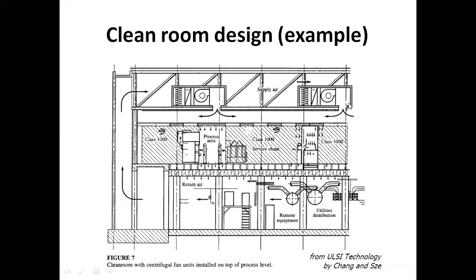So here you could see the air conditioning unit which is blowing the air conditioned air, and that air is passed to the HEPA filter. And in the HEPA filter, the dust and dirt is removed, and we have clean air. And these are the air conditioning systems where the air is cold and then it is circulated, recirculated inside the clean room.